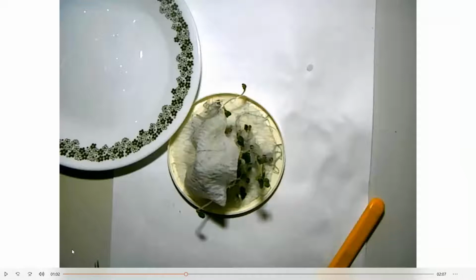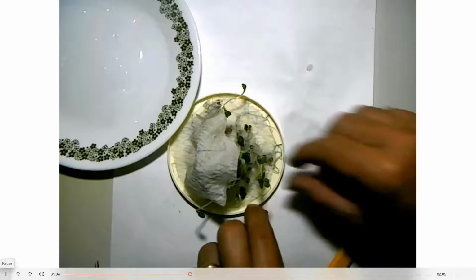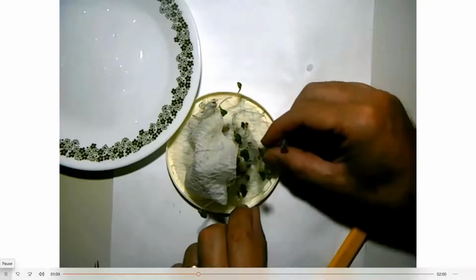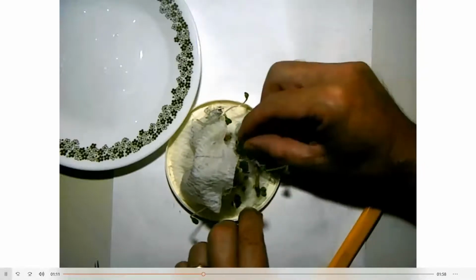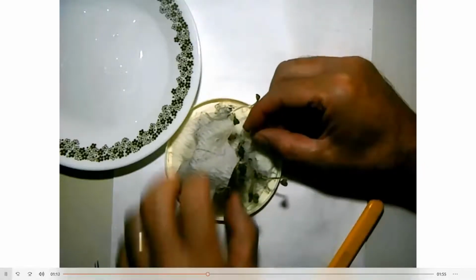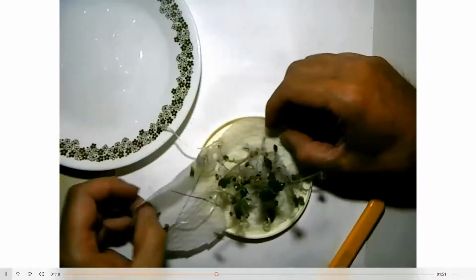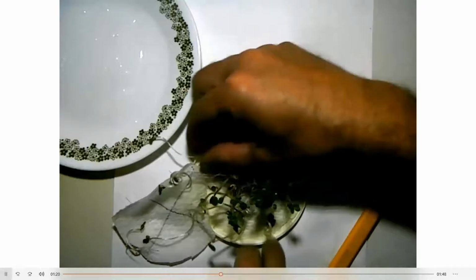So remember the seeds I started for the seed viability exercise we did in the lab? So these are the radish seeds. I think I let them go a little longer than I should have to examine their roots. So as you can see, they're kind of a mess, and I was trying to isolate individual roots there. So instead, I checked on the grass seeds that I had started, and they looked a little better, but still they were a little bit of a challenge.